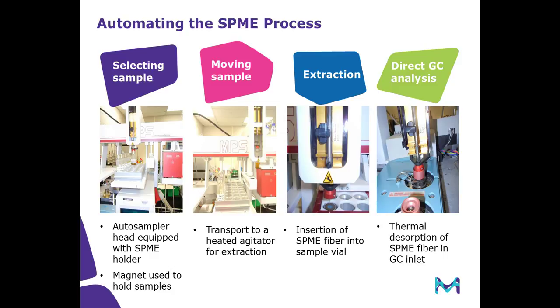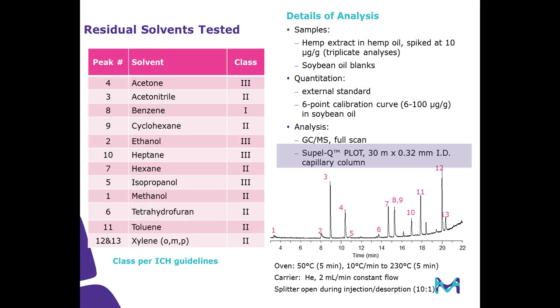It's really very nice. And these are called XYZ autosamplers, and they can also be used for other things too, liquid injection and other things too. So they're multi-purpose, and they can be used for SPME. So I used SPME first to look at residual solvents.